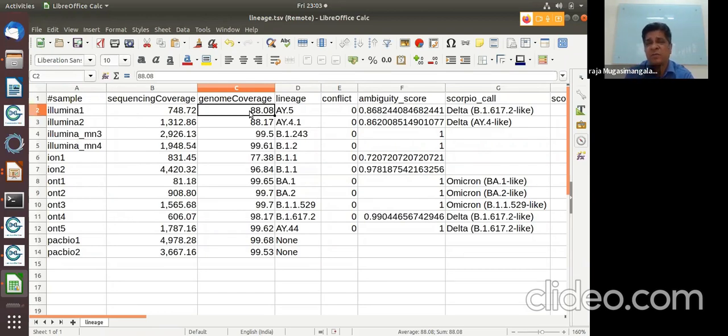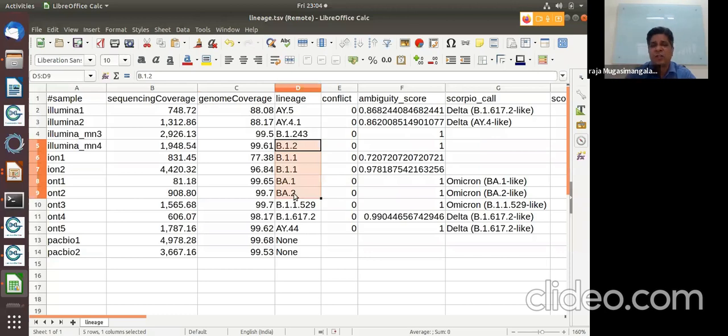So we are planning something to show that if it doesn't belong to any clade, can you find something where it actually lies, right? And you have to have enough samples because one sample might be an anomaly. If we have 4 or 5 samples showing something strange, then we can try to say that, hey, this is a potential new one. Technically speaking, these things are all potential new ones of those days. No one actually probably tried to expand it out.